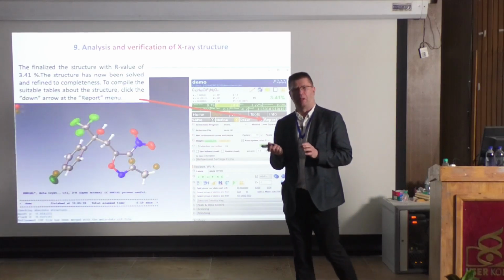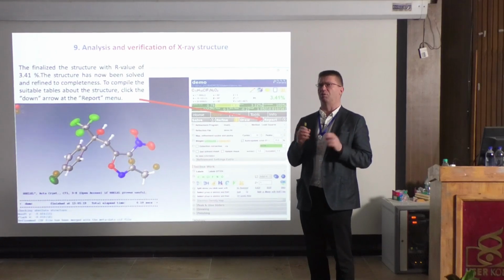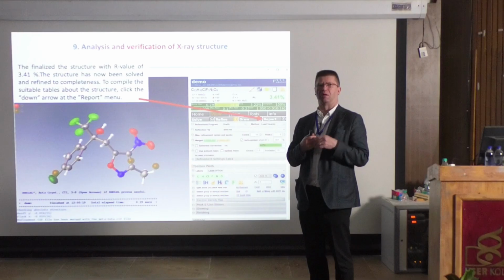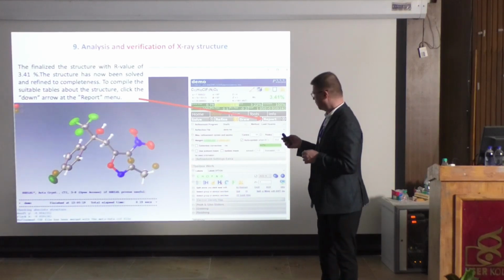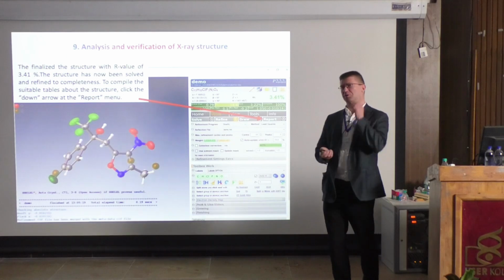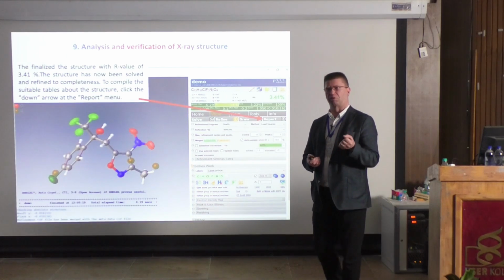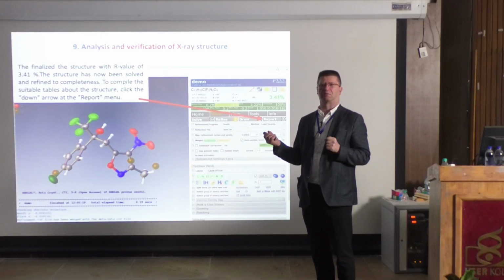And now, yesterday we went through the idea of how it really happens in real life with the program. So we were able to solve the structure, and we were able to see that, okay, everything is fine. So now we move to the final step, which is the analysis and verification of the X-ray structure. And this is very important. It is at least as important as growing a crystal, being able to analyze what you have done.